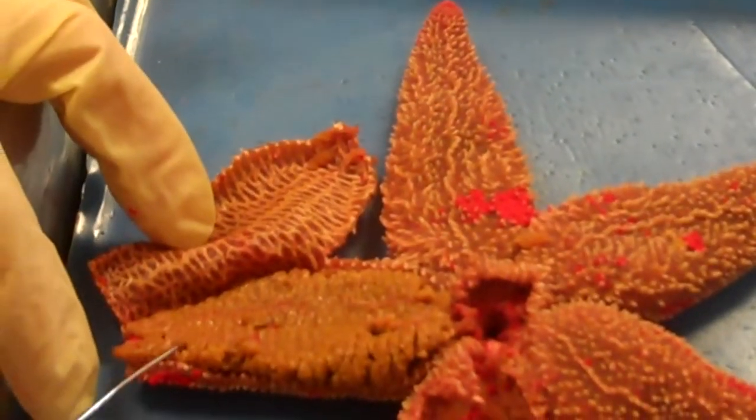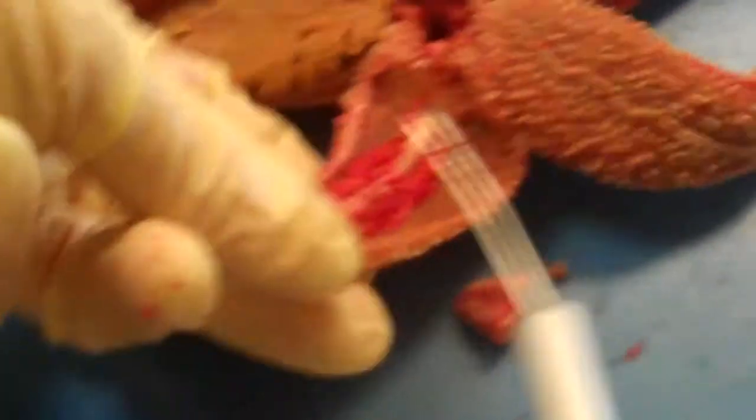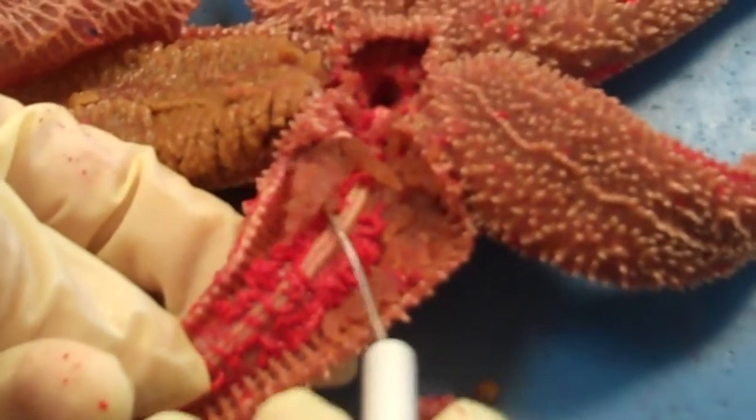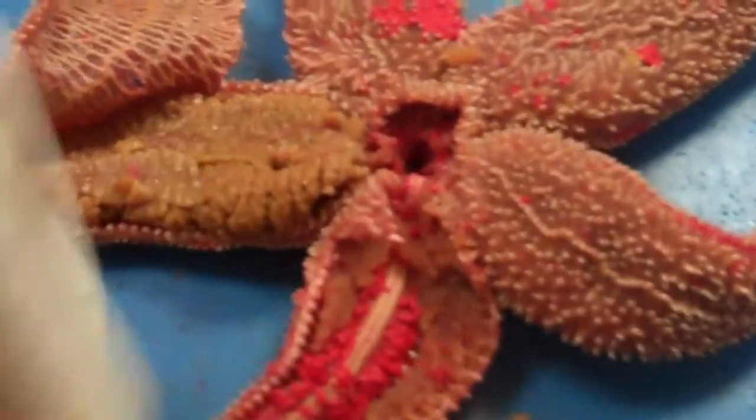We dissected this open. You can see these are the digestive glands, or pyloric ceca. They extend the full length of the arm. When you remove them, underneath you can see the gonads, which run about a third to halfway down the arm and stay on the lateral side of each arm.